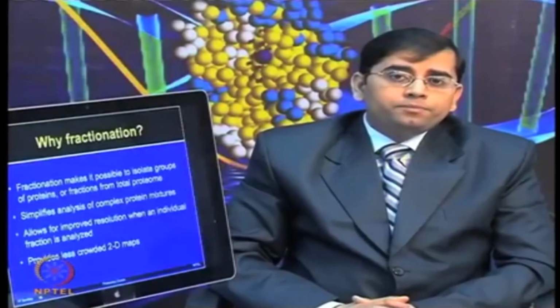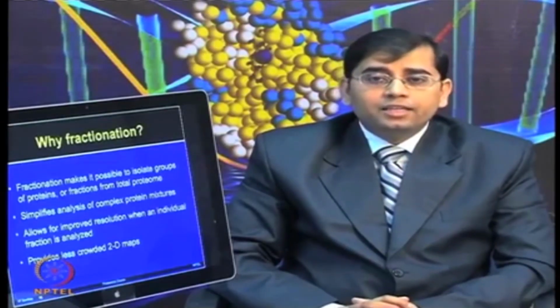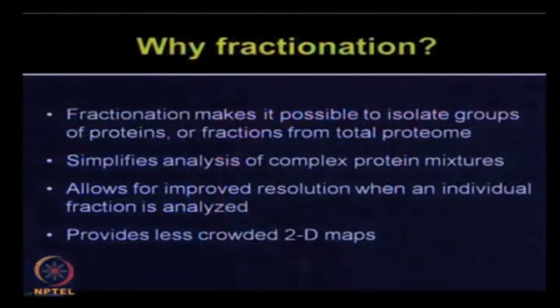So, why perform fractionation? Sample fractionation makes it possible to isolate a group of proteins, or fractions, from a given total proteome. By doing fractionation, you can simplify the analysis of a complex protein mixture. This method can further allow improved resolution of proteomic data, and when you obtain data from individual fractions and pool it together, it is going to be more informative.